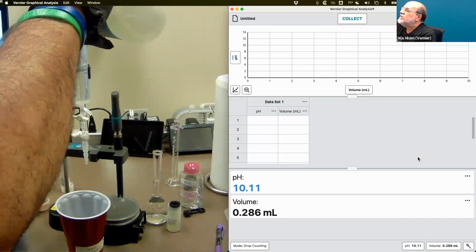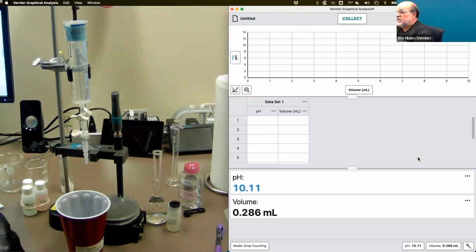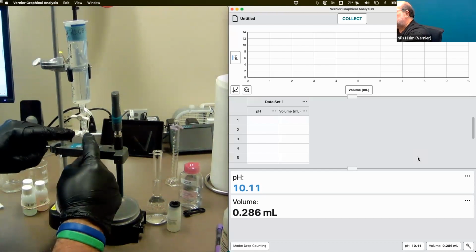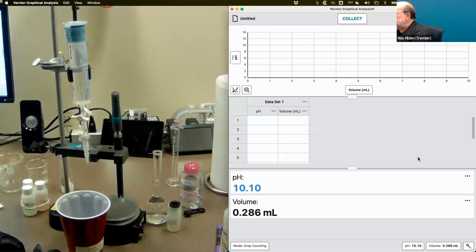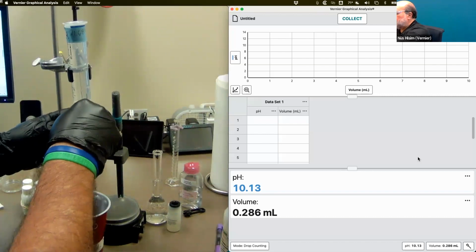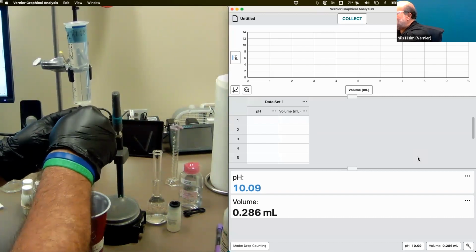So you would have to provide this for your students unless you did something like experiments 6 and 7 in advanced chemistry, where you actually do find the concentration of an unknown acid. So the bottom is the on-off switch. I'm going to leave it off. Well, temporarily right now, I'm going to turn it off. Okay. And the top one is the rate. So what I'm going to do is I'm going to let that go until I can get a drop rate of about 1 per second.